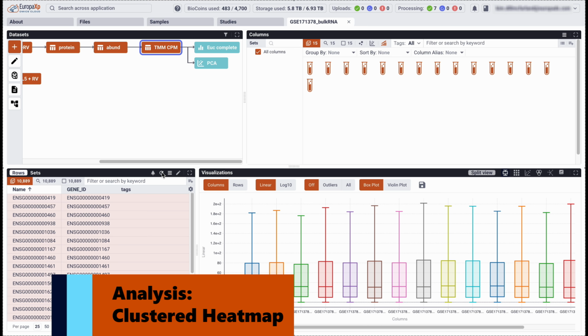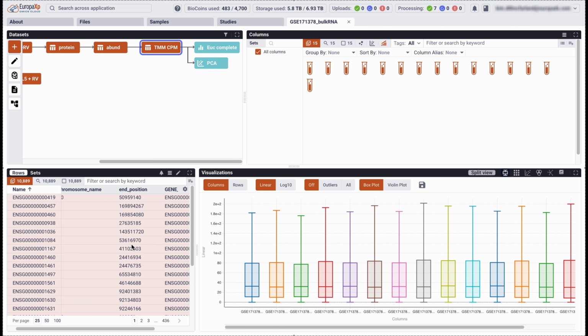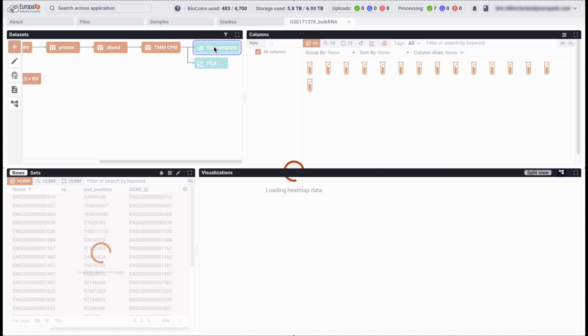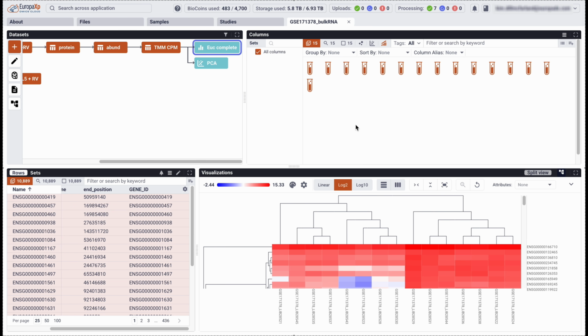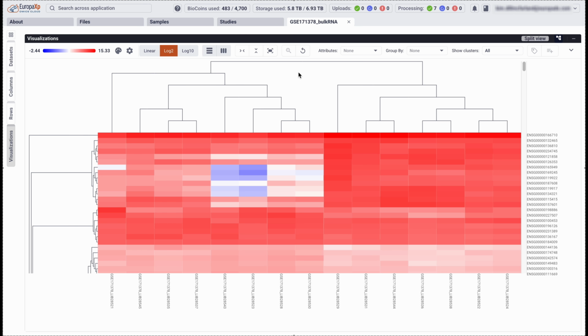While we were doing this, we see that our 2 analyses completed. So let's take a look at the clustering first. We can use the full screen view in order to see this large heat map. There are a number of settings to change the look, including log transformation, and this is a dynamic HTML plot where we can hover to see information for each cell.